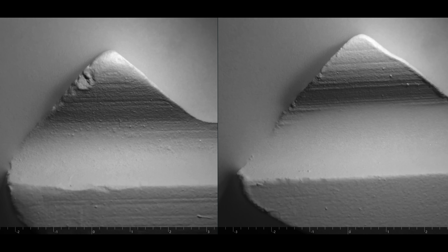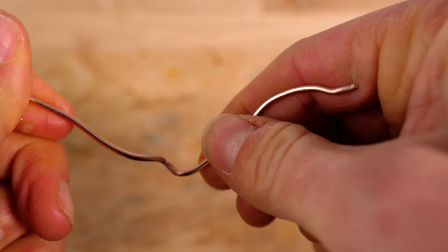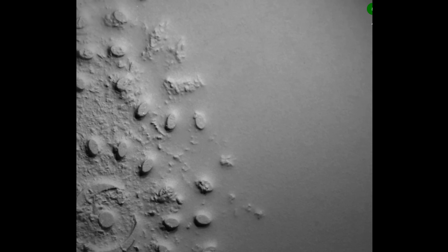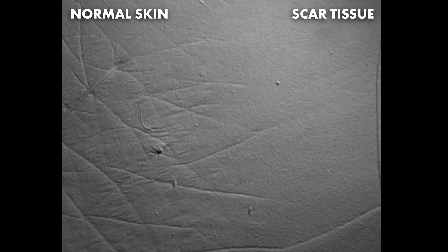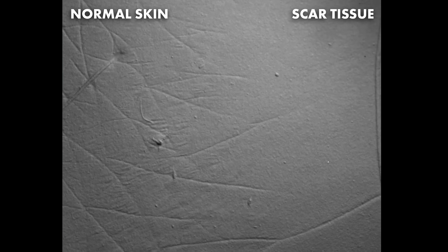It's interesting in general to look at old things versus new things under the GelSight. Here's a fresh razor blade versus a used one, and here's an old key versus a new key. If you bend a wire back and forth, it eventually snaps — that's metal fatigue. Under the GelSight you can see all these fissures near the break point. This is a brand new foot scraper and this is after it's been used.